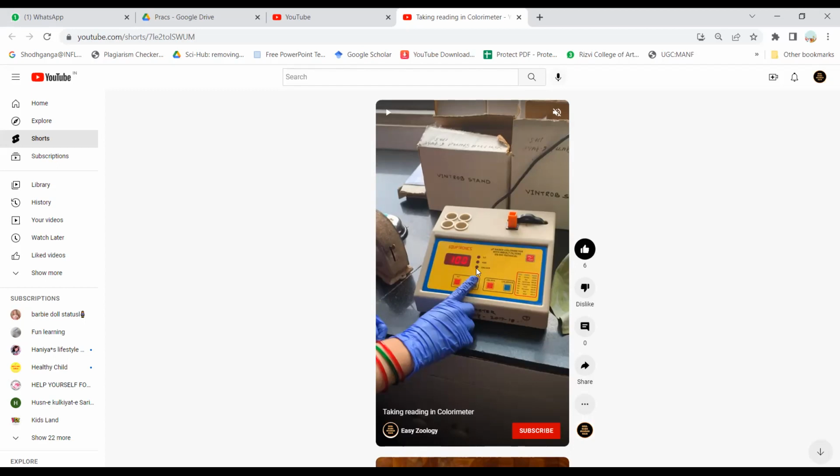Yes or no? This arrow is visible to all. Yes, ma'am. Okay, very good. Ma'am, when you press this unlock button, one light will blink here on the unlocked side. Okay, so now your machine is unlocked.